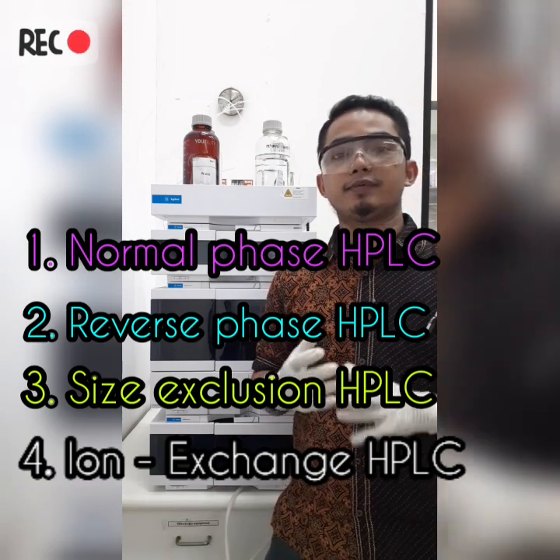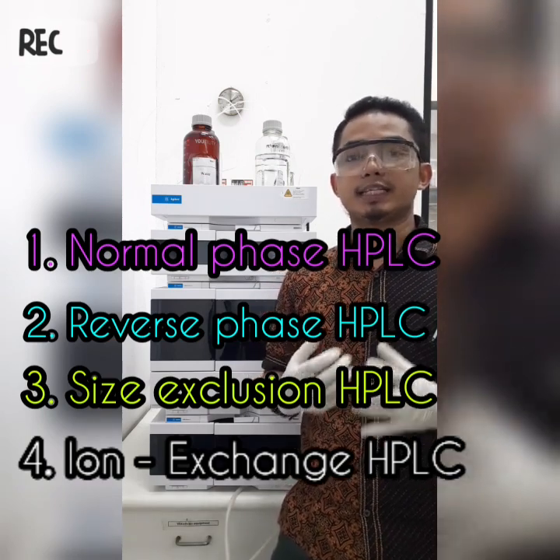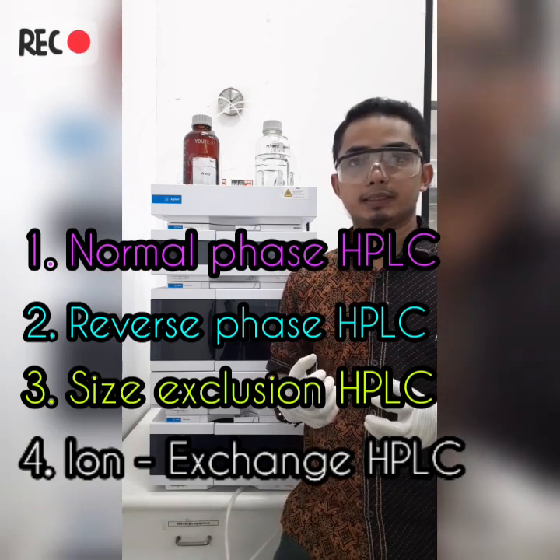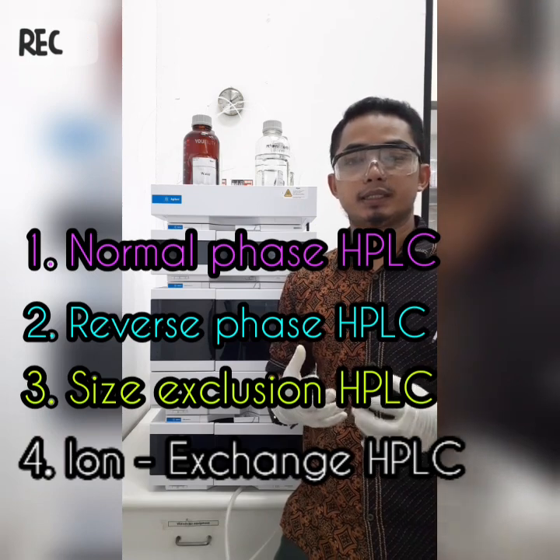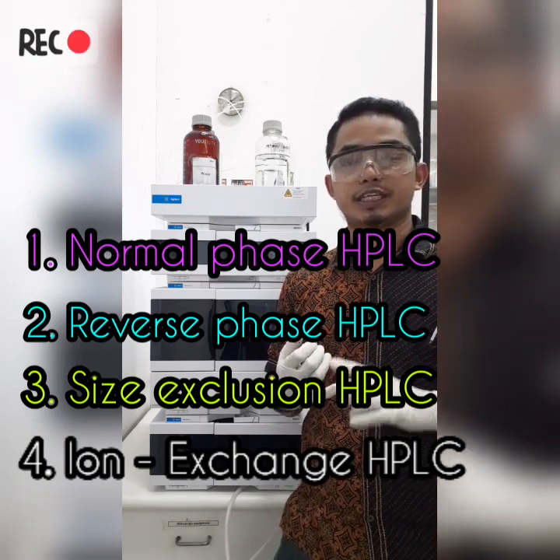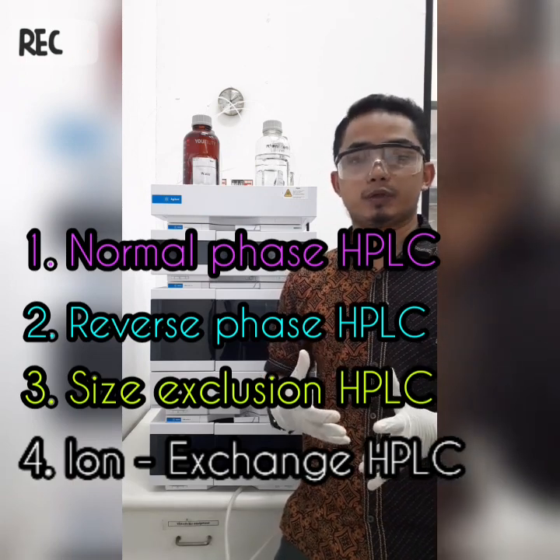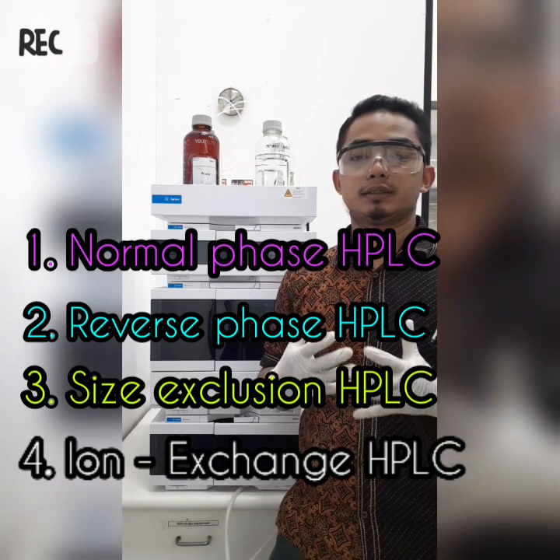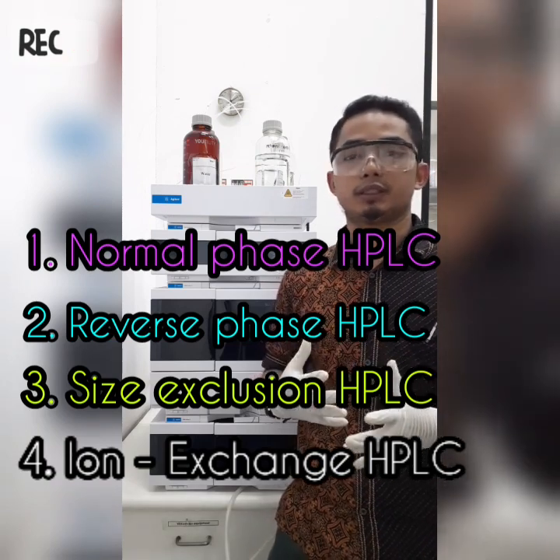Number 2 is reverse phase. The stationary phase is non-polar, okay, different from normal phase. For reverse phase, the non-polar liquid is for stationary phase, while the mobile phase is polar liquid, such as a mixture of water and methanol or acetonitrile.